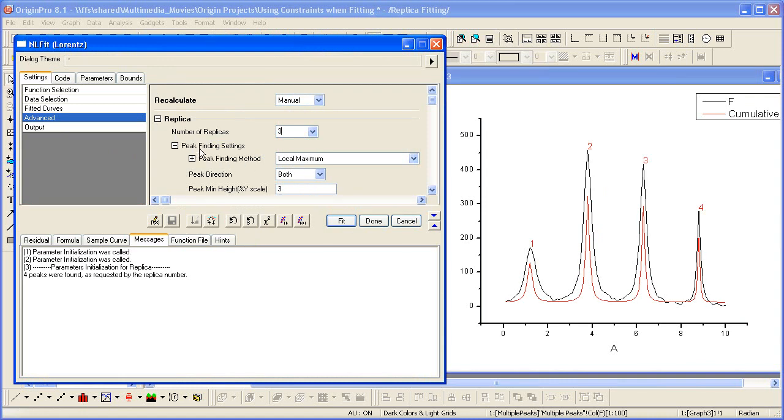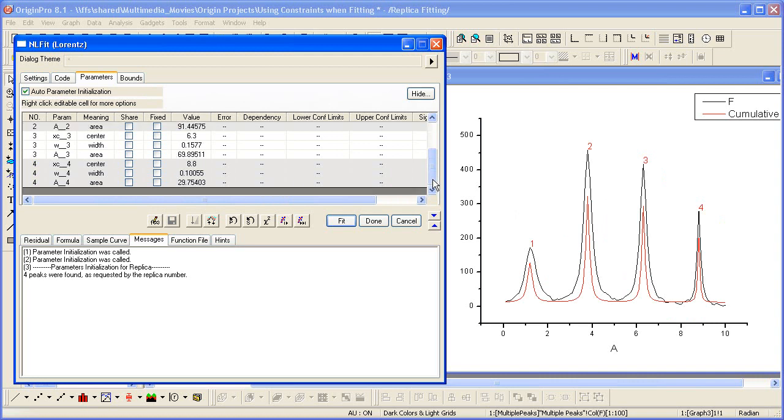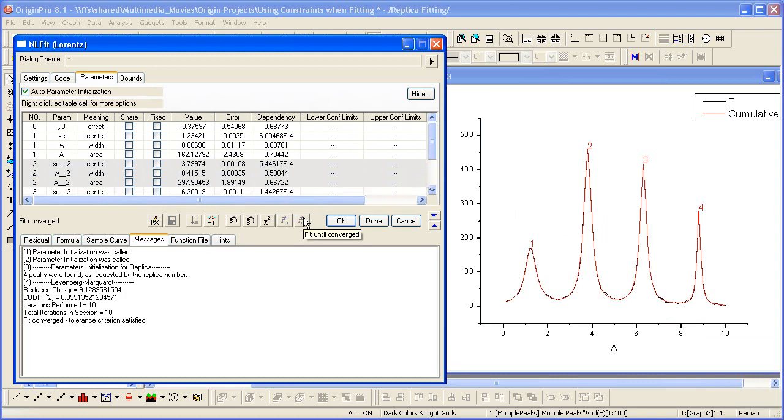Based on these peak finding settings here, notice that Origin automatically found all four peaks. Then if I go to the parameters tab, this means that all four sets of parameters here have been initialized. So again, let's fit until converged.